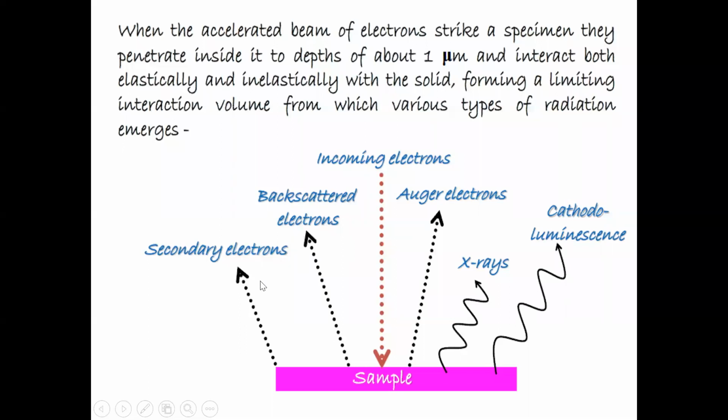So it only depends upon when the accelerated beam of electrons strikes your sample and then penetrates inside, to a depth of about 1 micrometer.